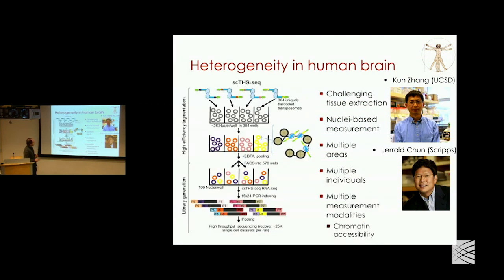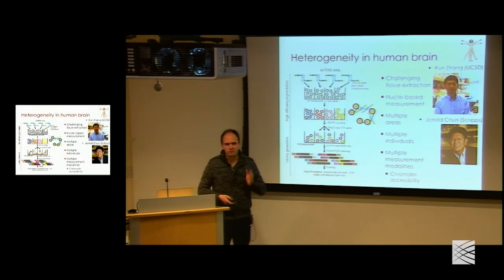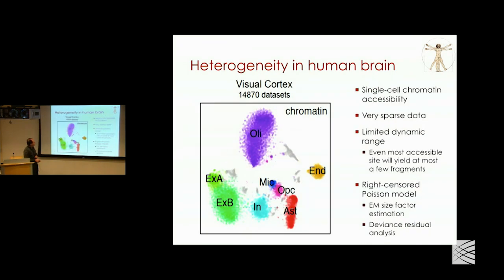Now, the other thing that was done in this study is epigenetic measurement. So essentially, it's kind of like a single-cell chromatin accessibility assay, like single-cell ATAC-seq. They have a slightly different protocol, THS-seq, which is based on a hyperactive transposase mutant that actually gives us more yield per cell. But the approach is based on index sorting, like Jay Shendure's lab, split pool indexing. So essentially you sort the nuclei, you label them through a transposase reaction, and then you relabel them with a PCR.